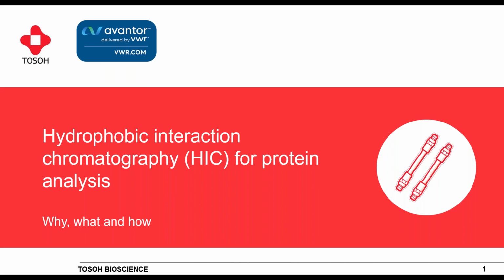The presentation will explain how HIC works, presenting some application examples and providing tips and tricks for method development.